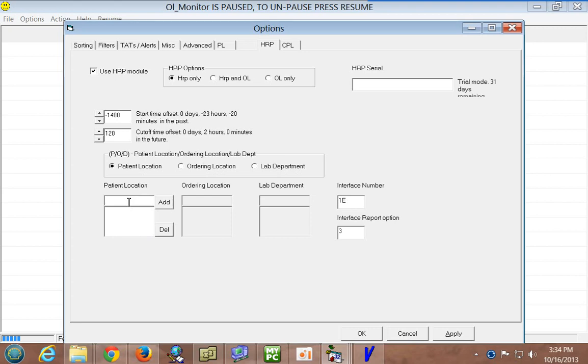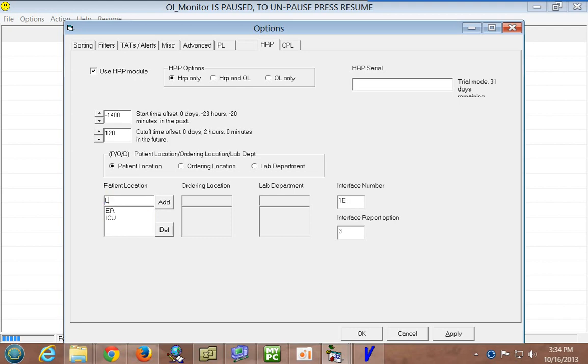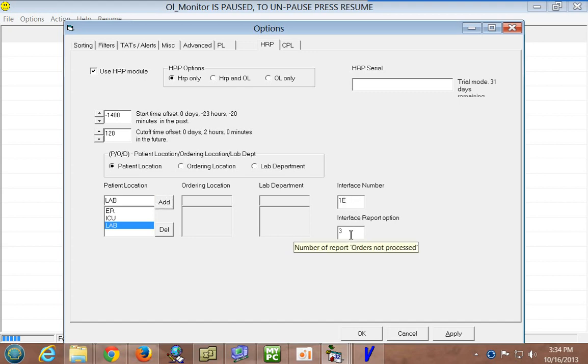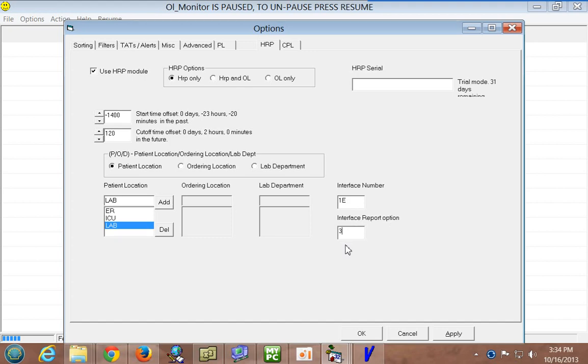So, you can add as many locations as you want here, clicking add. And so on. You can just go nuts here if you like. Let's get that right. Alright, important to know what your interface number is. And that's different for everybody. And the interface report option is another prompt that comes up in SunQuest. But unfortunately, I can't show you that right now. Hopefully, you're familiar with it already. So, you've got that set up.